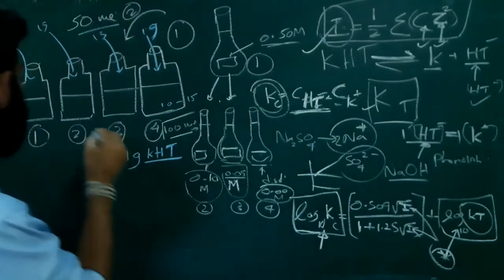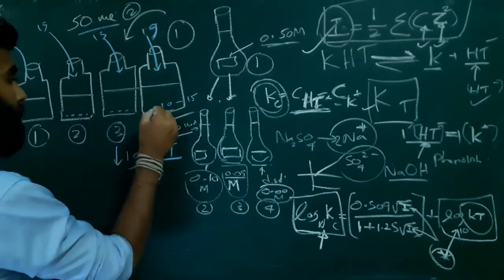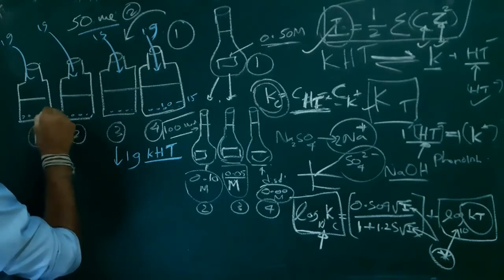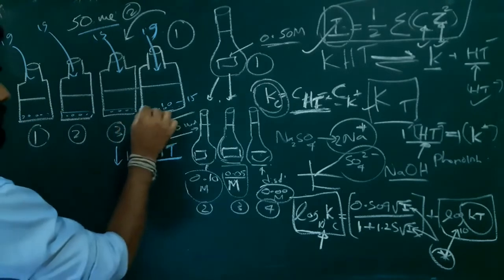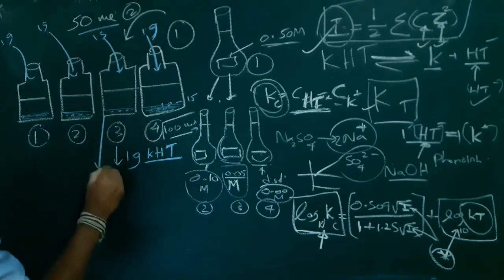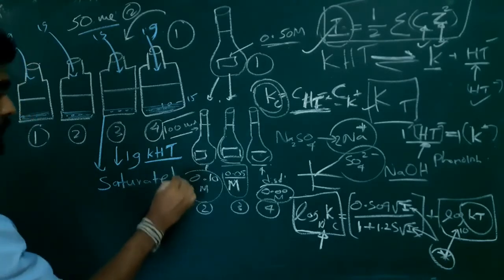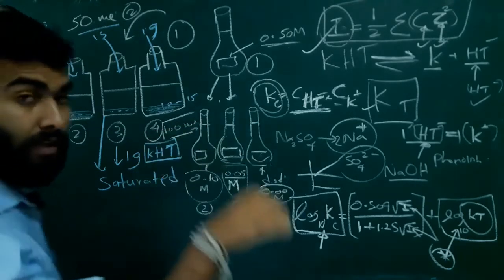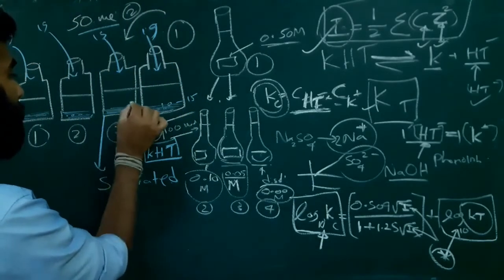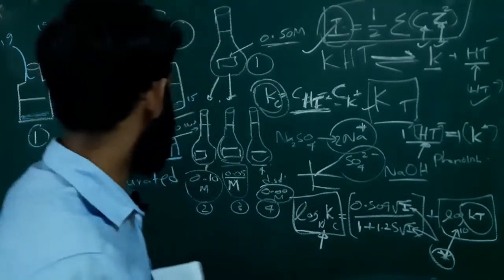After some time, we can see there is some undissolved potassium hydrogen tartrate. However much we shake or mix, the remaining potassium hydrogen tartrate will not dissolve. That means the solution is saturated. So we need saturated potassium hydrogen tartrate solution with different ionic strength, and we achieved that, because the remaining salt will not dissolve further.